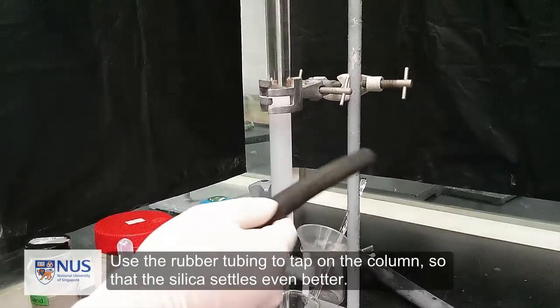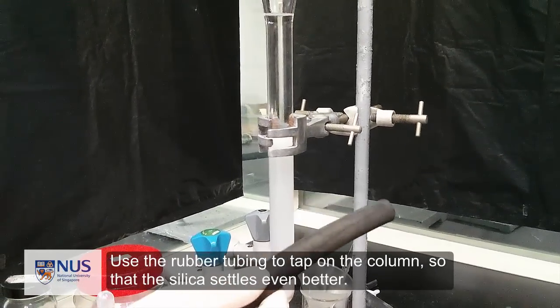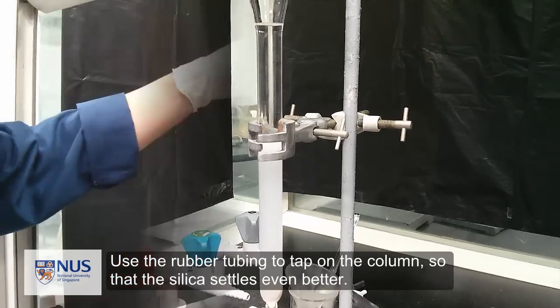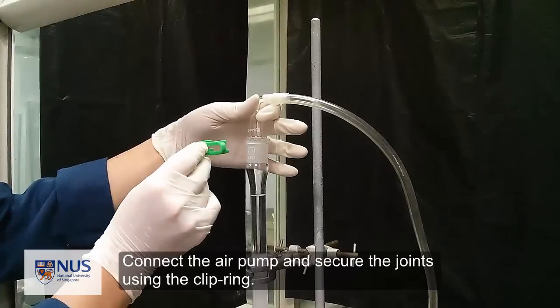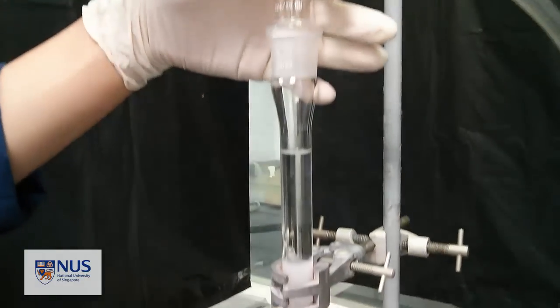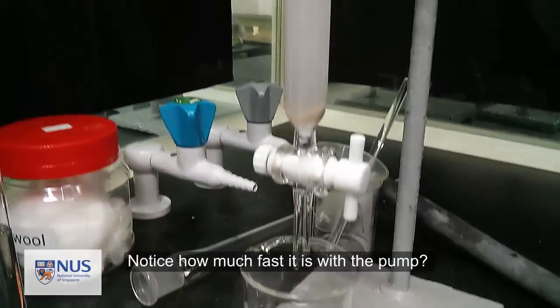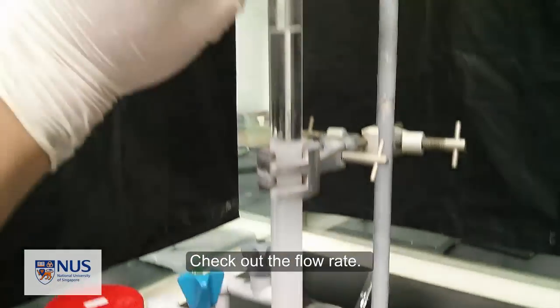Use the rubber tubing to tap on the column so that the silica settles even better. Connect the air pump and secure the joints using the clip ring. Check out the flow rate—it's much faster.